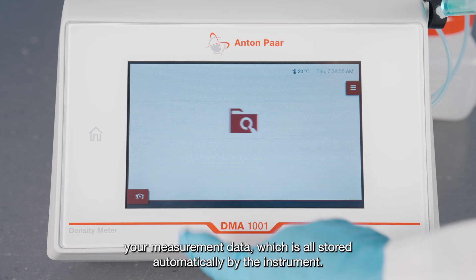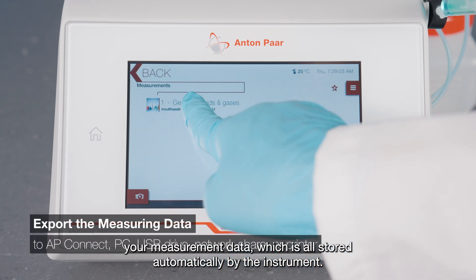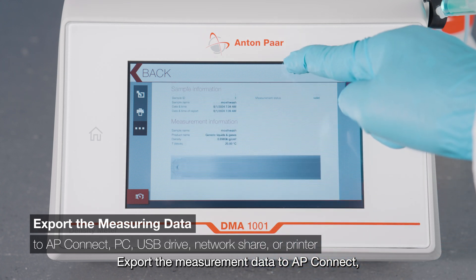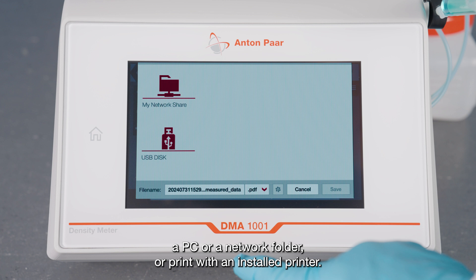Access and analyze your measurement data, which is all stored automatically by the instrument. Export the measurement data to AP Connect, a PC, or a network folder, or print with an installed printer.